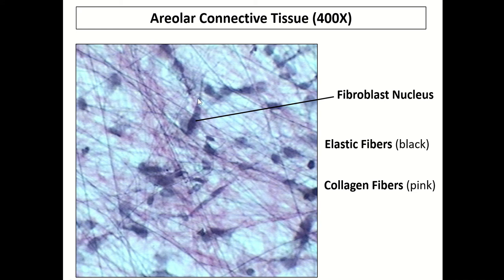And when you see this, it's a nice elongated cell. You can also see this nice elongated fibroblast down here. Of course, again, the nucleus denotes where that cell would sit. And as you can see here, these cells are not closely packed together. Lots of space between them. Now that space in itself is called the extracellular matrix, filled with a number of things, including lots of water. And then as you can see here, fibers.